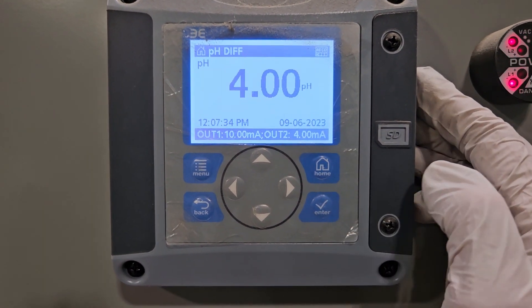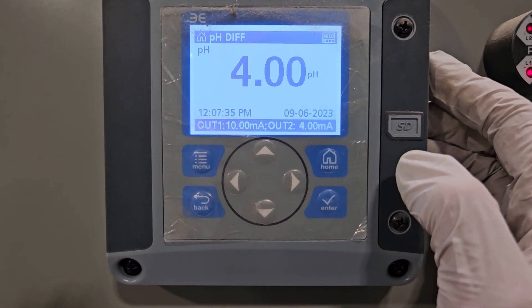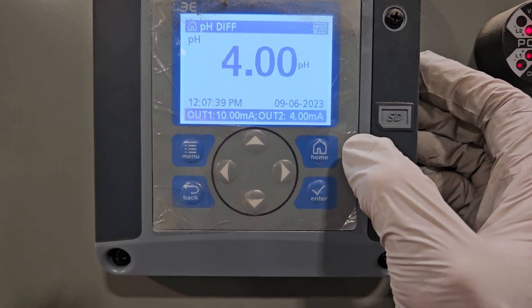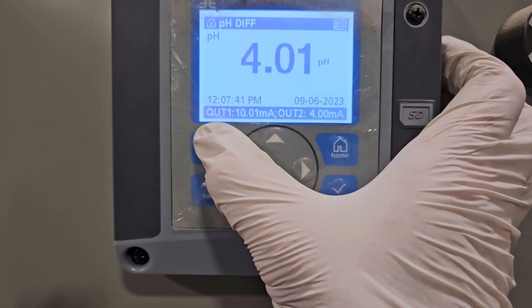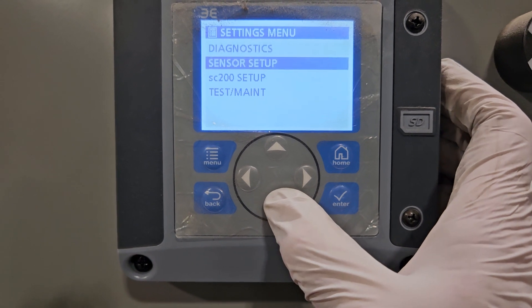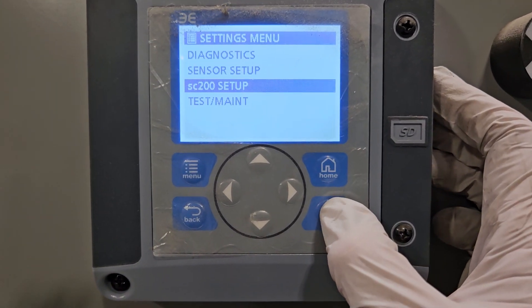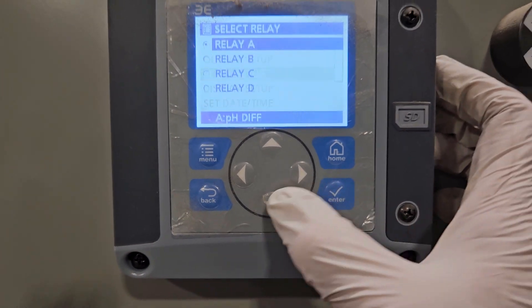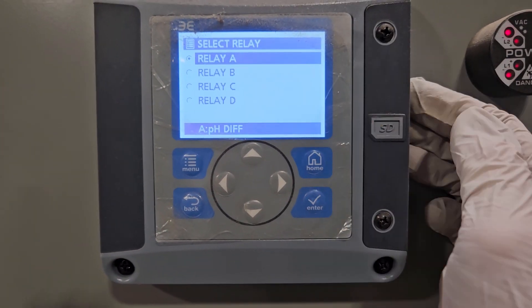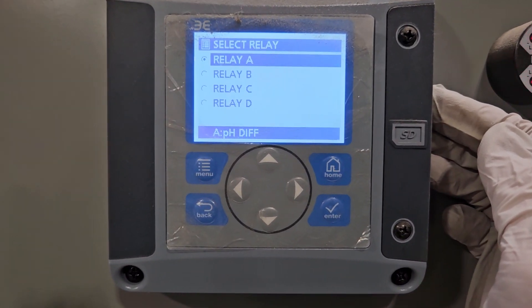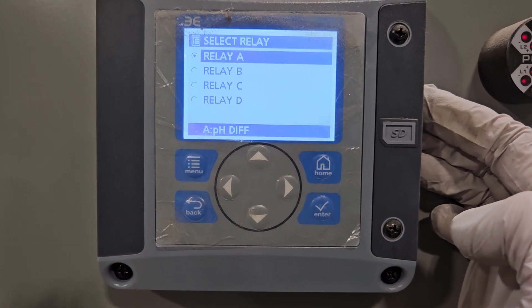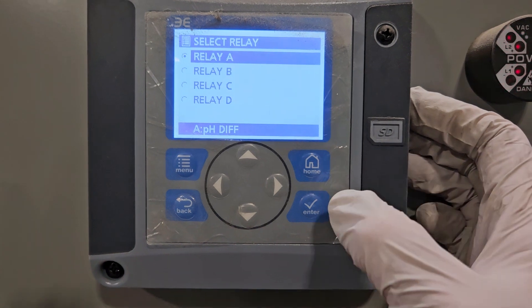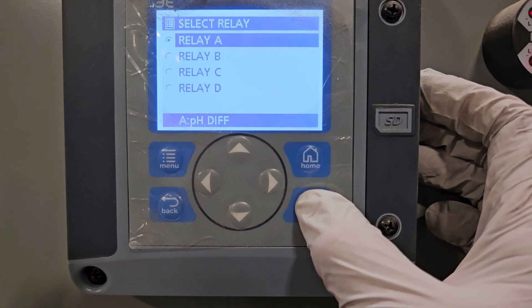For setting up the relay, Relay A is for caustic or lime type additions — alkaline additions. You go to the menu, go to SC200 setup, then to the relay setup. Relay A is for lime or caustic additions. Relay B is for acidic product conditions — acidic coagulant additions if you're using pH to control the addition of the coagulant.